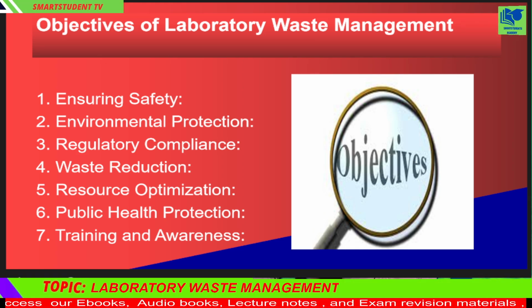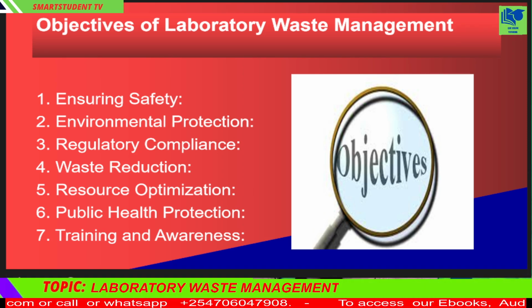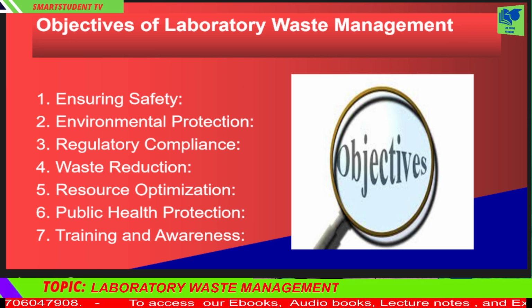Effective laboratory waste management has multiple layers of importance, each contributing to a larger goal of health, safety, and sustainability. First and foremost, managing lab waste protects laboratory personnel from exposure to harmful chemicals, infectious agents, and sharp objects. For instance, improperly disposed needles and glass shards can cause injuries and infections. Beyond personal safety, waste management reduces the risk of environmental pollution. Chemicals leaching into the soil or waterways can disrupt ecosystems, contaminate drinking water, and pose long-term health risks to communities. For example, mercury waste from a chemistry lab, if not properly disposed of, can enter water systems and bioaccumulate in fish, eventually harming human consumers.